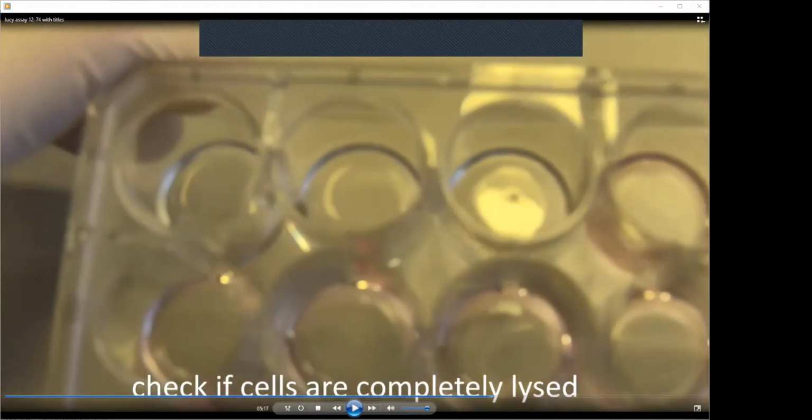In the meantime, you can check your samples which were rotating at room temperature to see if they are lysed. And that has to be complete lysis. How can you see that? If you hold this against a dark background, you see that there are such clumps of cells, so they peeled off the plate. You have to play a little bit against the light or against the dark background.